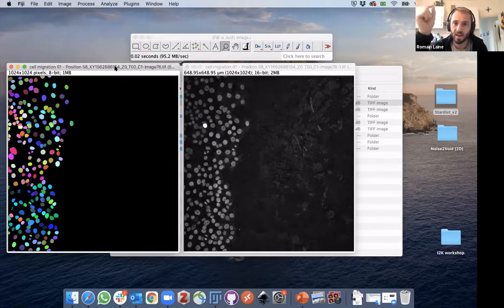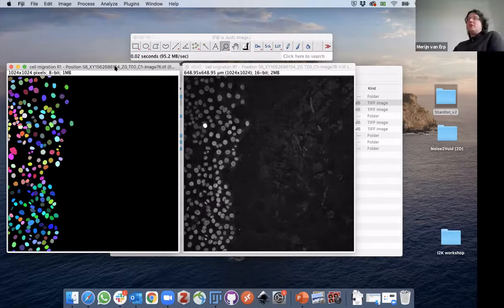The neural network doesn't really care about the absolute value. That's something that's assigned afterwards. Okay. Now you say across images. If you're talking about tracking nucleus over time, then that's something you do in post-processing once everything's kind of segmented, right? No. I was indicating that if you have a number one label in one image, then it isn't necessarily the same as the number one label in another image.